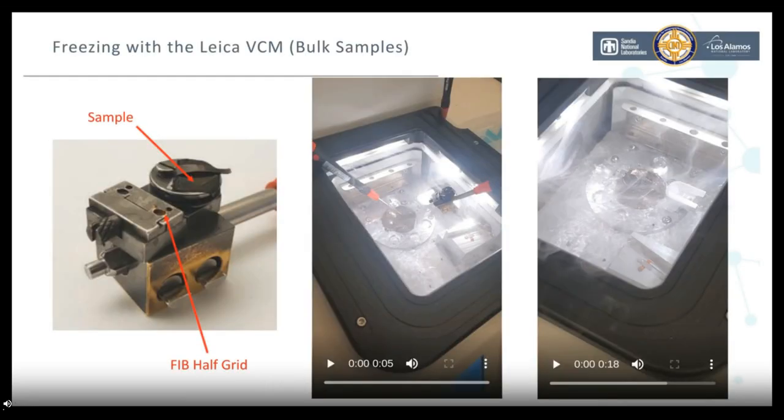And the other thing for polymers that we've found is that they can be very brittle under LN2, and so trying to mount them and manipulate them after they're frozen, you can just shatter them. It can be quite difficult. So one method that we found works pretty well is to mount the sample at room temperature and then just freeze the whole setup.